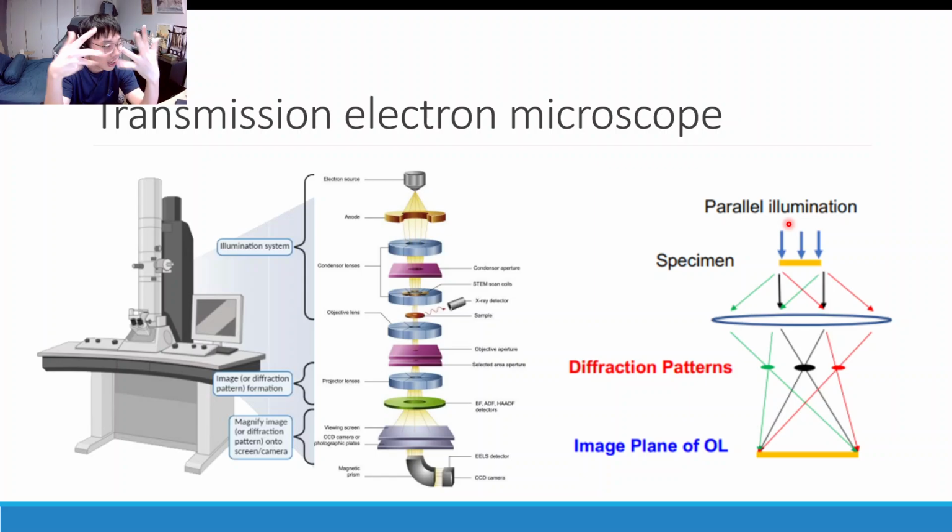Because you can imagine that a crystal lattice consists of regularly spaced atomic planes, and so obviously this can act as a gigantic diffraction grating that will cause the interference of the incoming beam and the formation of a diffraction pattern. And so, of course, in the diffraction pattern there will be various maxima, and the electron beam from any of these maxima can actually be used to form the resultant image. So each of these maxima, if you allow the beam to diverge and then capture it in the image plane, can form an image of your sample.